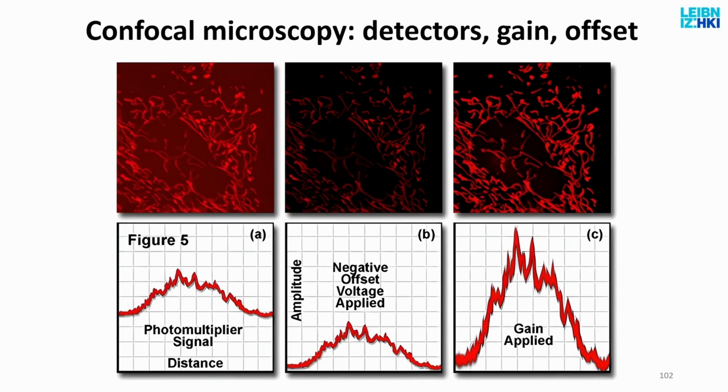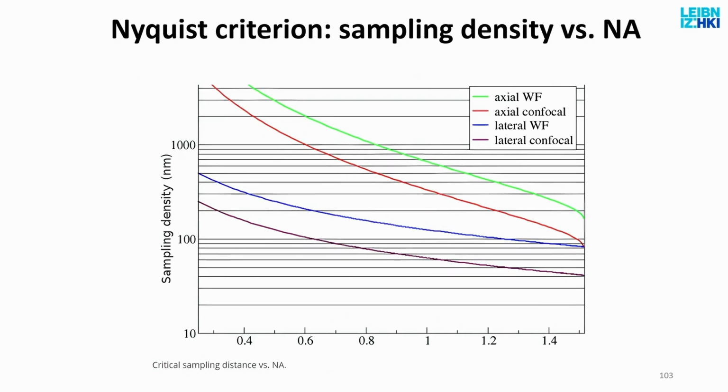And pre-processing alone is risky because you are removing something that you should not. So the best you can do on the analog side, you can. Don't overdo it. If you compensate too much, you might get rid of the dim signal like here, and then you made a big mistake. So if you're not sure, leave it alone. Only do this if you know what you're doing.